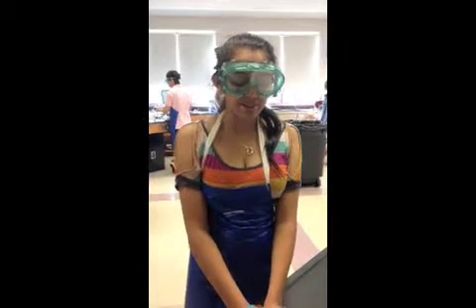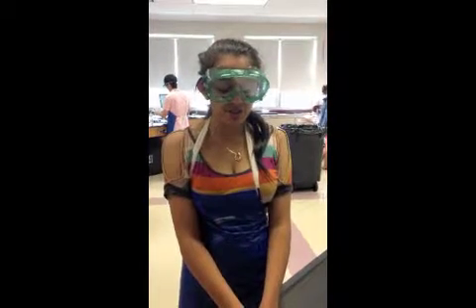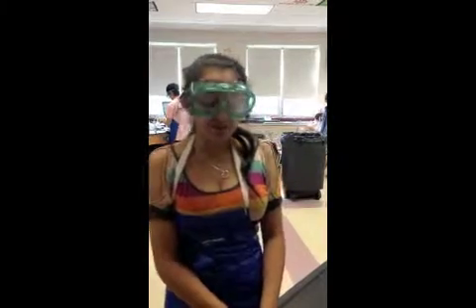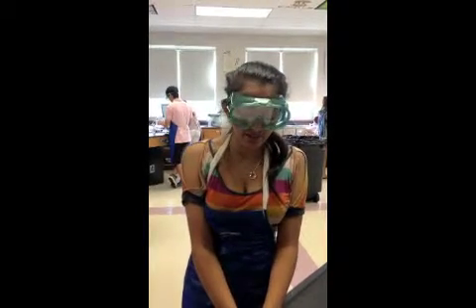A few things to remember: you must keep the solution in the beaker stirring constantly, the burette must be washed with Alconox and then rinsed with the solution that you will put in the burette to reduce the chance of contamination, and you must release the solution by dropping it slowly because the equivalence point will be reached quickly, and you must be able to close the valve in time so that you can get accurate results.